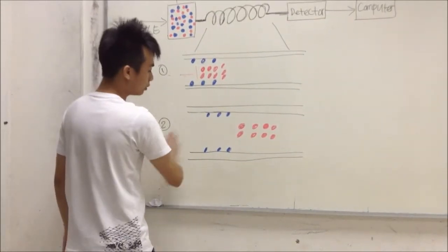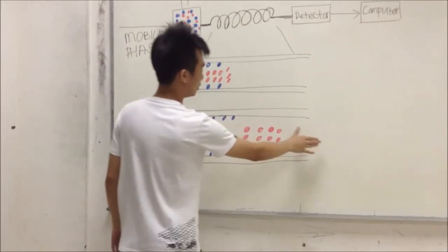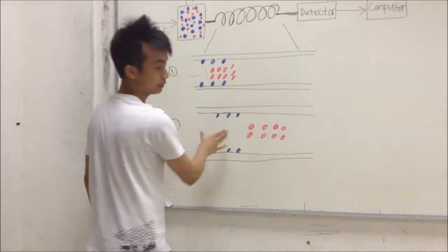Therefore, compound A will proceed to the detector, followed by compound B.